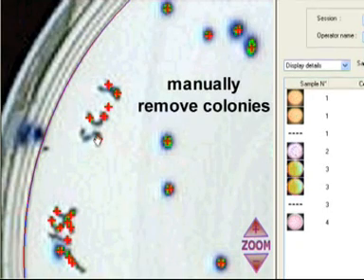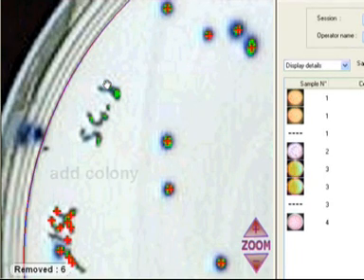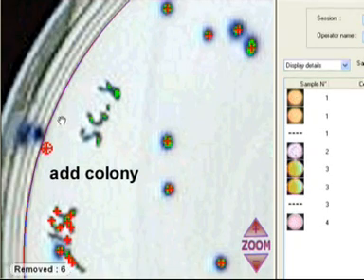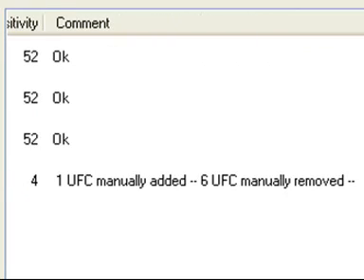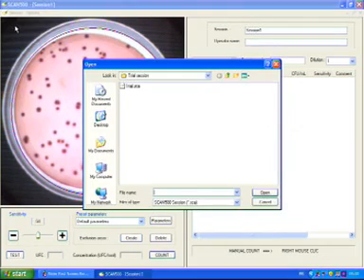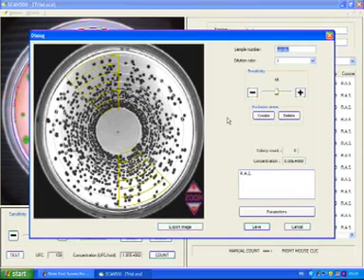You can also manually remove or add colonies one-by-one. Select the comments area. All your petri dish pictures and data can be saved. You can check, recount and modify your data at any time and export to Excel.